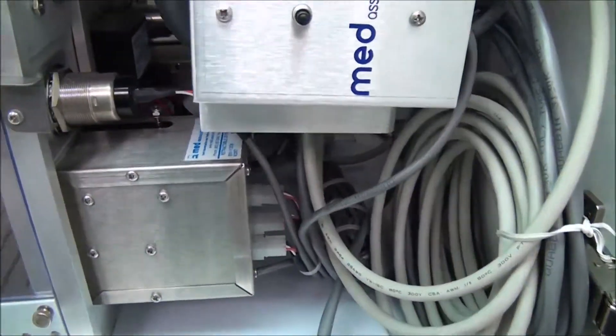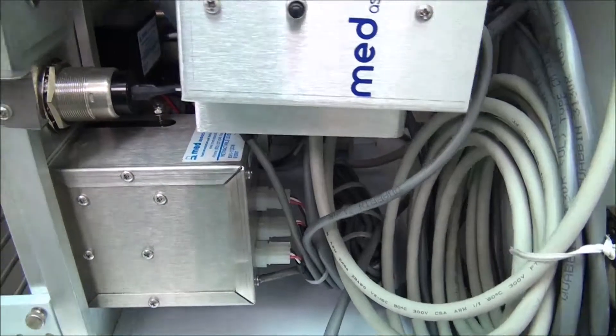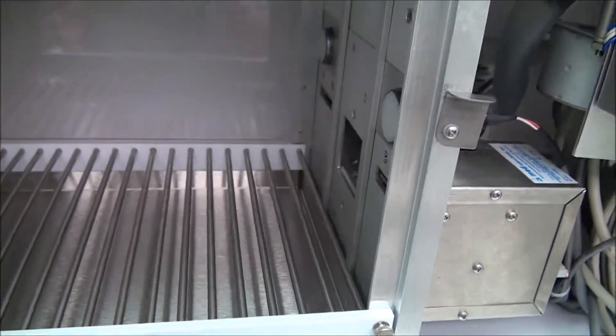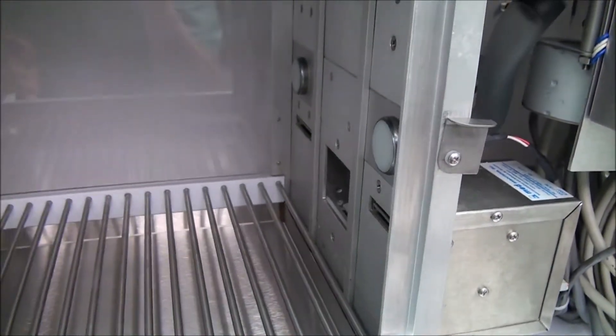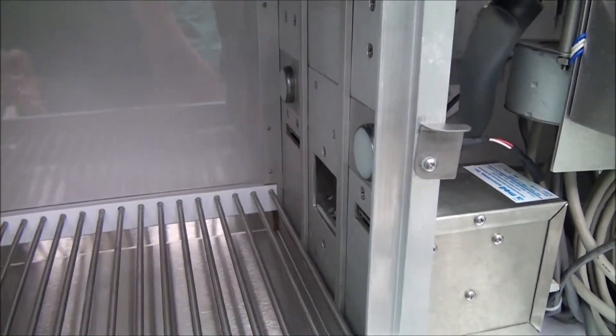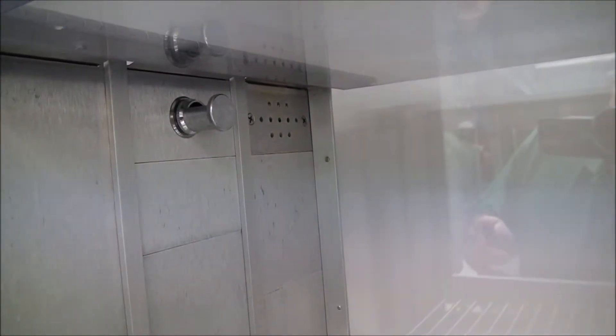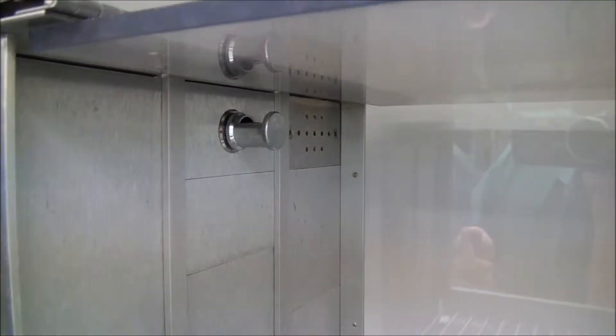So it gives you the guarantee that he will get his pellet when he hits one of the levers that would be programmed. And then up in the corner here you can see the speaker there, and also the house light.